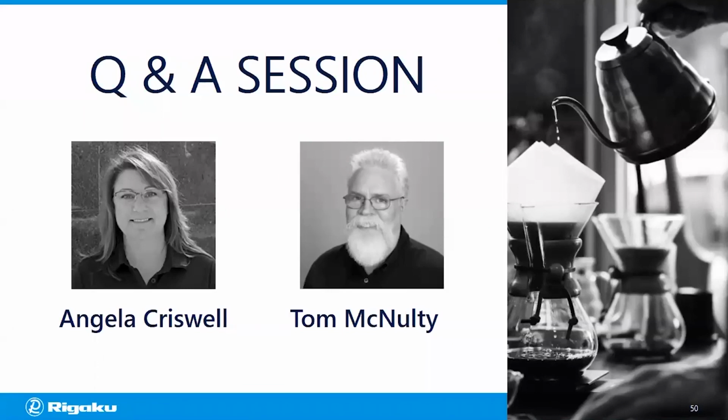Okay, interesting. David asked, which instrument was used to collect the cranberry seed data, and what were the source and settings for the data collection? Yeah, so in that case, we used the HX130, which is the same instrument where you saw the plant imaged in full. The energy setting was anywhere from 60 to 90 kV. I usually take a few scans to see which one's going to give me the ideal contrast, and then I'll do a longer scan with that setting.